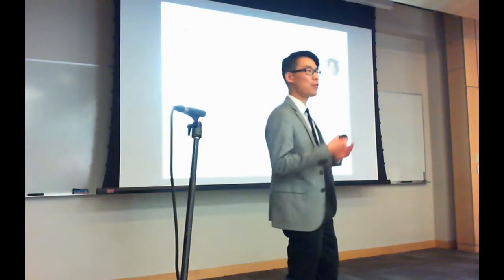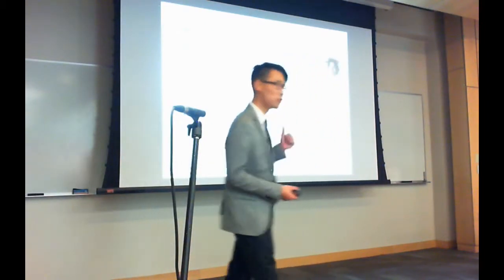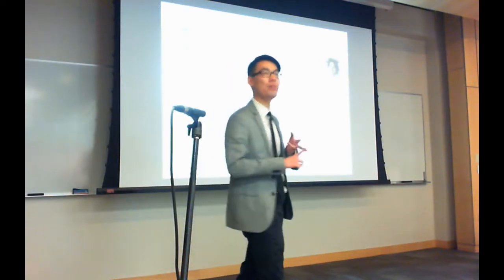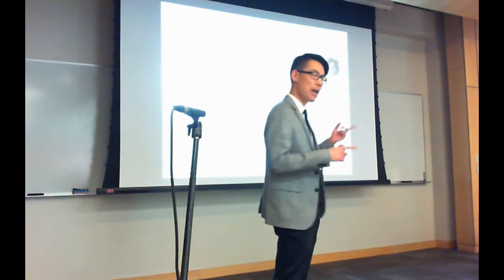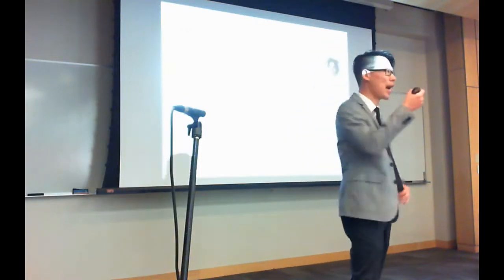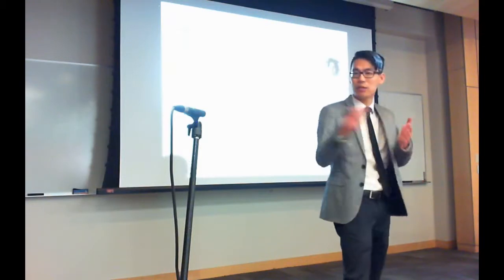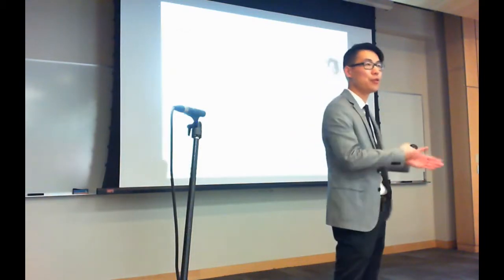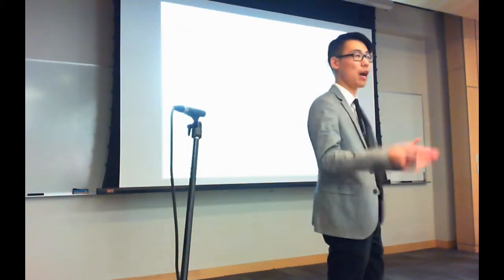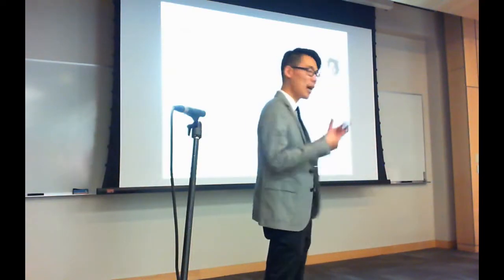Unfortunately, for library matches, we can't estimate this distribution, this red distribution, either analytically or empirically. We can't do it analytically because we have to have the notion of what a random spectrum coming out of the mass spectrometer is, and we have no good model for that. How do we generate them so that they look faithful to real spectra, but they're not actually real compounds? Second, we do have a large corpus of data, but it's not large enough.